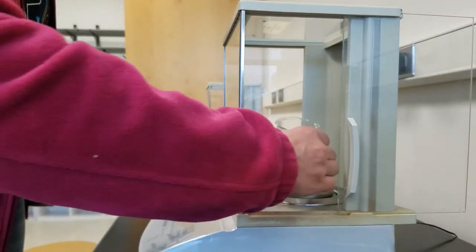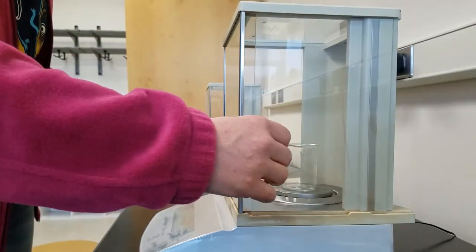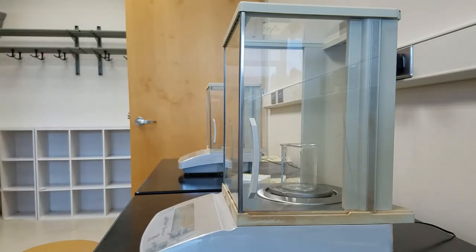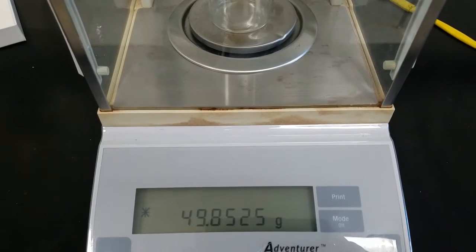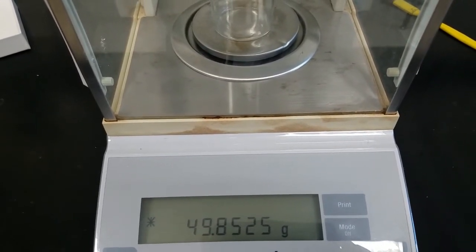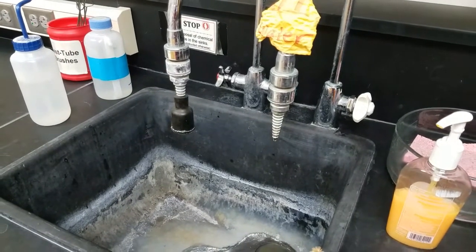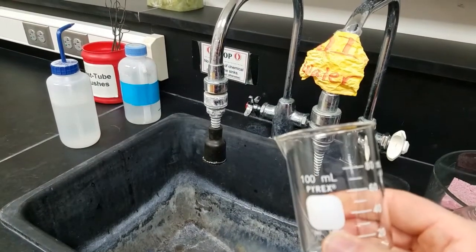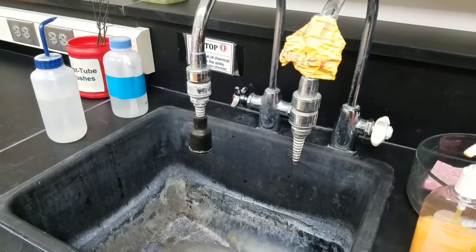We open the door, we place our beaker on the balance in order to get our mass. The mass with our empty 100 milliliter beaker. We're going to obtain our DI water in a 100 milliliter beaker, about 50 milliliters.